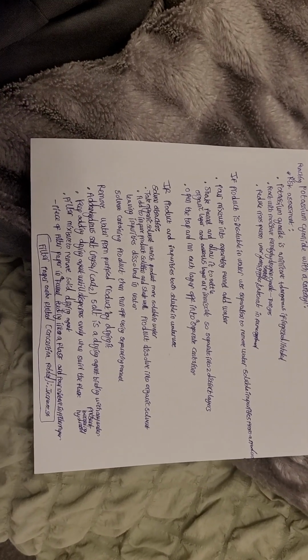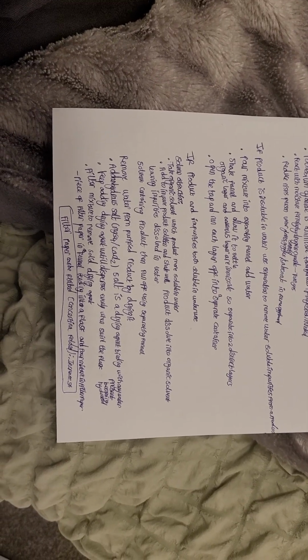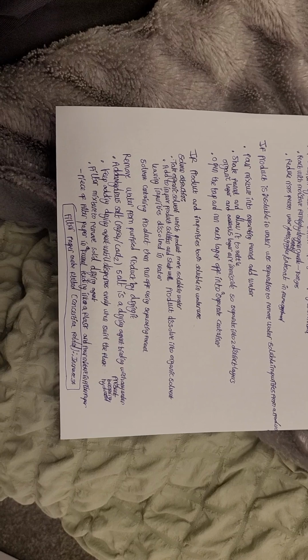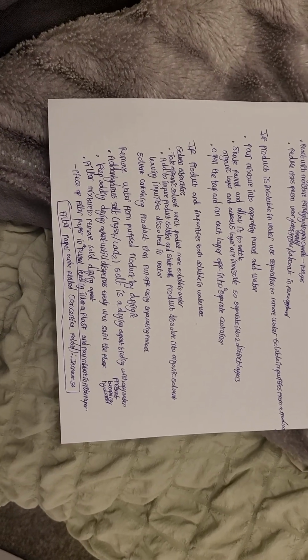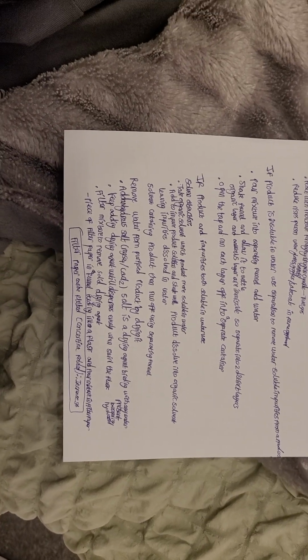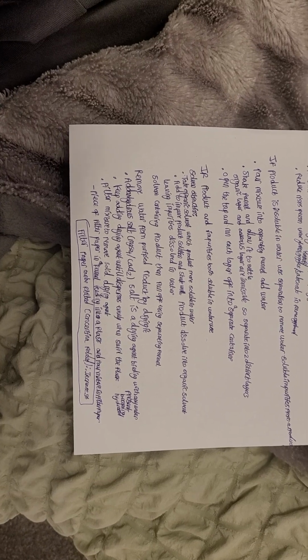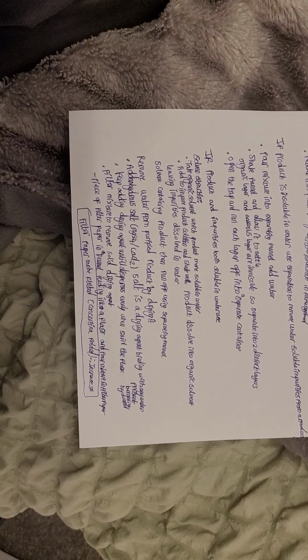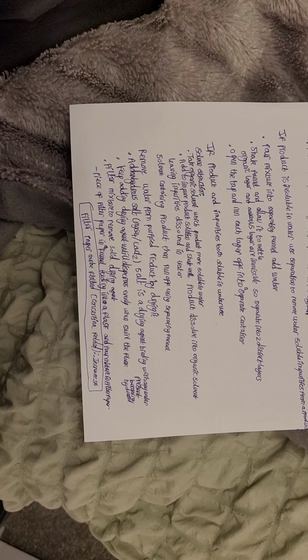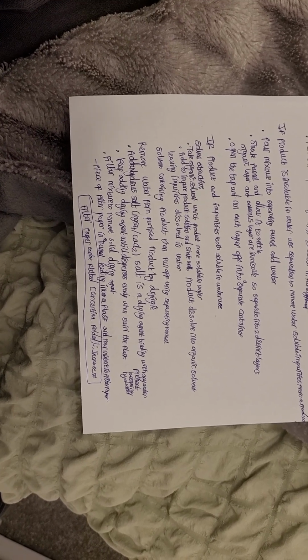Then we want to remove water from the purified product by drying it. So we want to add an anhydrous salt: magnesium sulfate, MgSO4, or calcium chloride. It's better if you know both examples of anhydrous salts, because the exam could ask you to name one. The salt is a drying agent, binding with any water present. As the salt binds with any water present, it becomes hydrated. Keep adding the drying agent until it disperses evenly when swirling in the flask.